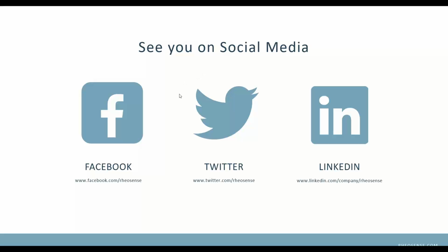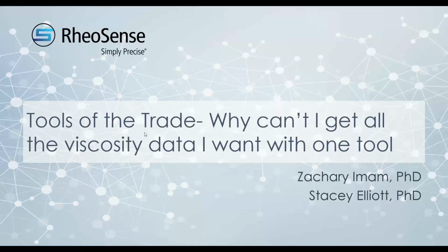This is Zachary, and today we'll be talking to you about why you can't just use one tool for collecting your viscosity data. This is actually a question that we get a lot about our instrumentation, but this is also true for other types of instrumentation like rotational rheometers or even capillary rheometers.